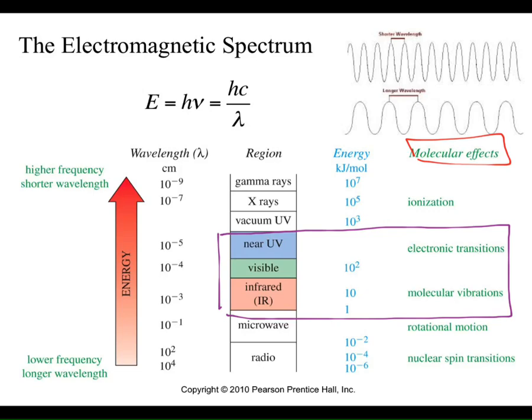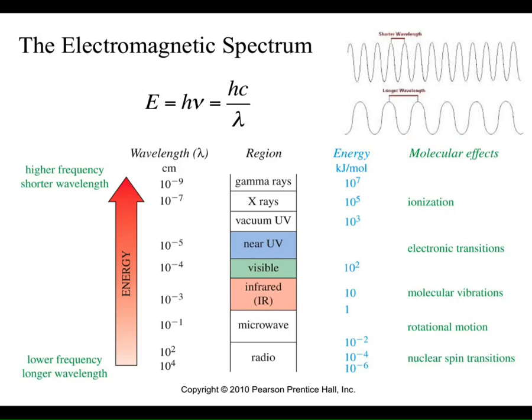Infrared energy is lower in energy than ultraviolet. Well, ultraviolet is causing an electron, an insanely tiny particle, to jump orbitals. Well, if we move to an even lower energy, we're going to get less things happening. Electrons are so tiny, we're not even moving the electron. Really all that's happening is we're causing the electrons to just kind of wiggle a little bit. Because the electrons are found in bonds, we now see the bonds wiggle. Okay? That wiggle is a vibration that we can detect using effectively the same technique in both forms of spectroscopy. So let's start with our higher energy one.